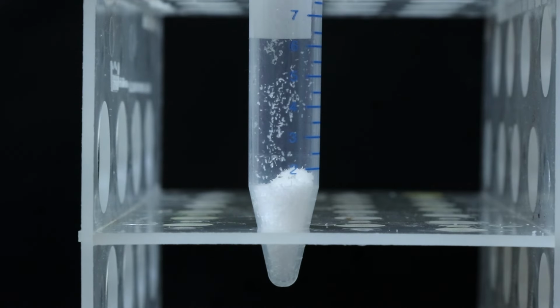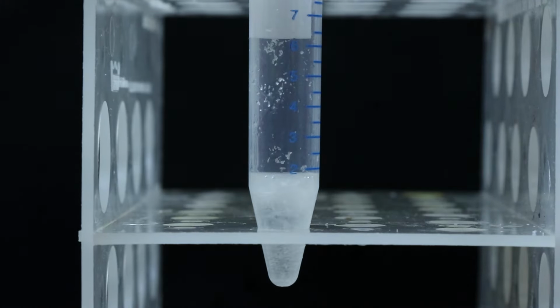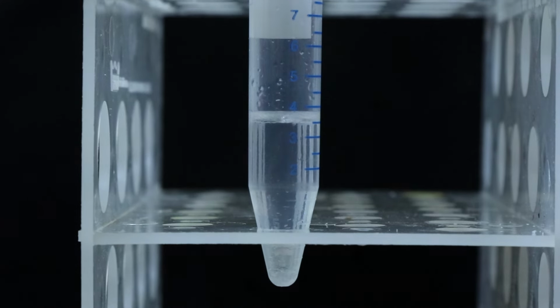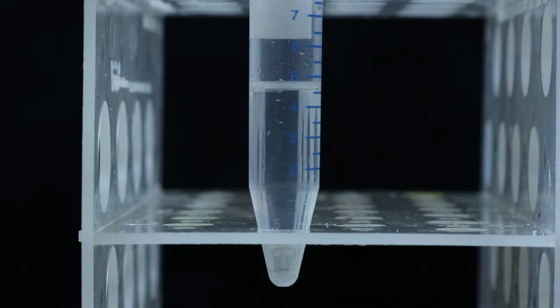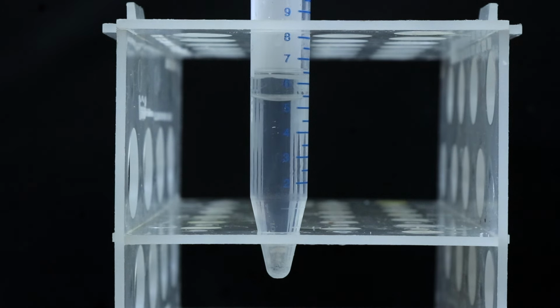So here's the mixture. I've already placed it into a polypropylene test tube, and now I'm going to start adding the methylene chloride to begin dissolving the compounds. And I added around 4 to 5 milliliters just to allow the compounds enough space to move around once I start mixing the 2 phases together. Then I'll add 2 to 3 milliliters of sodium bicarbonate, which should be enough to deprotonate all of the acid, but not too much just in case I have an acid that is soluble in water.